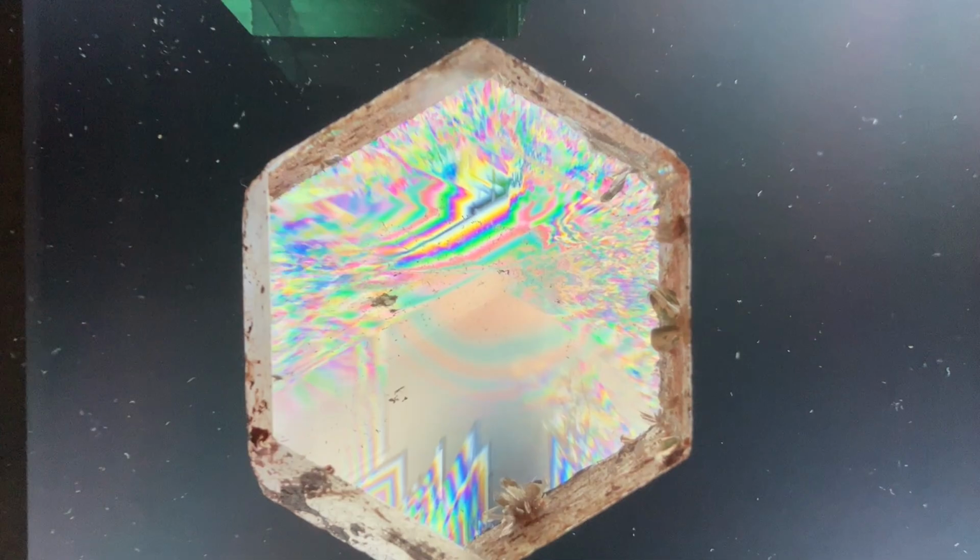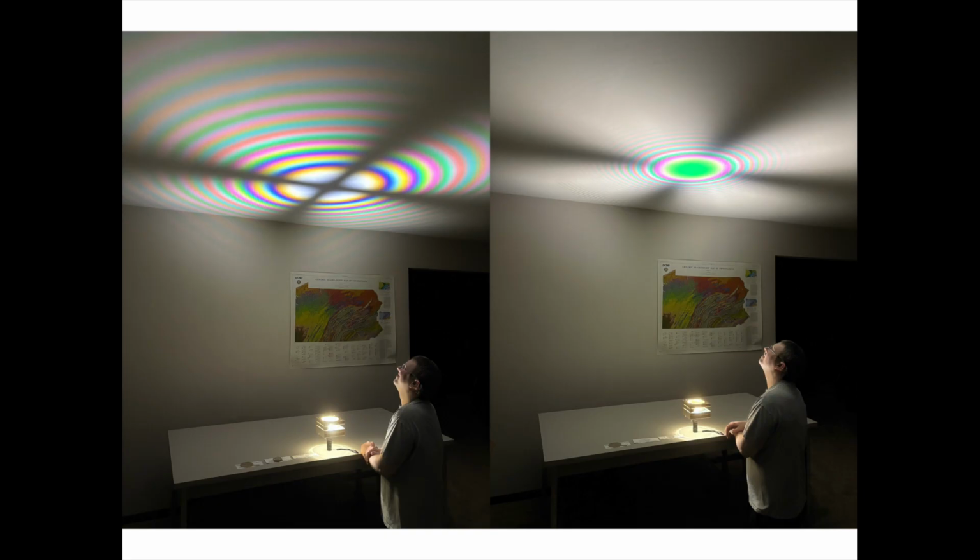But first we have to talk about a fairly unique property that quartz displays known as optical activity. When we bring our camera even closer to our quartz, we can actually see one of the effects of this optical activity. And that's in the generation of the quartz uniaxial optic axis interference figure. I'm actually going to grab a piece from the educational video Snellius Minerals Interference Figure Projections now to talk a little bit more about this.